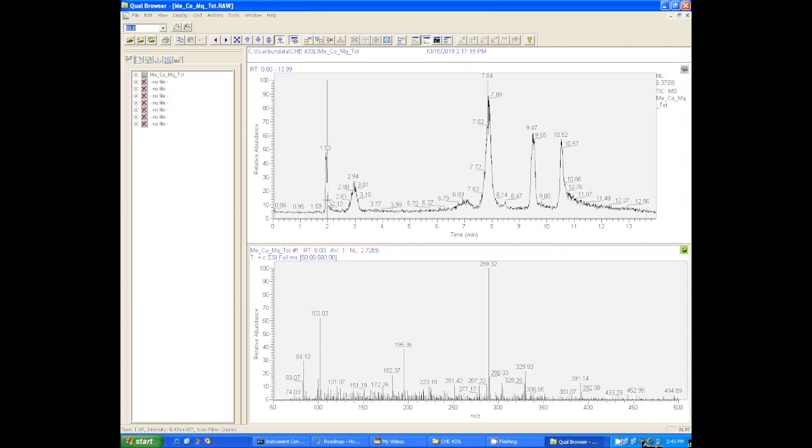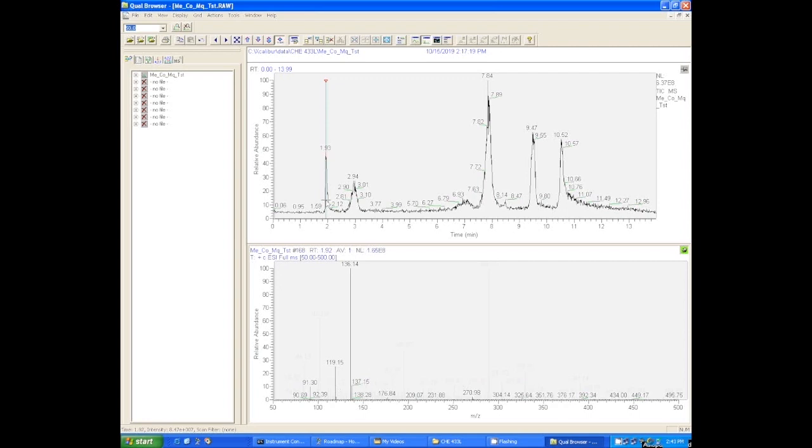What that means is that when we click on the chromatogram here, wherever we click on the chromatogram, the mass spectrum for that point in time pops up in the window on the bottom. So you can see we're clicking here and here and we're looking at all these different mass spectra at different points in time. You can also click on one point here. I'm pushing the sideways arrow and that will scroll through the mass spectra near that point that I clicked.